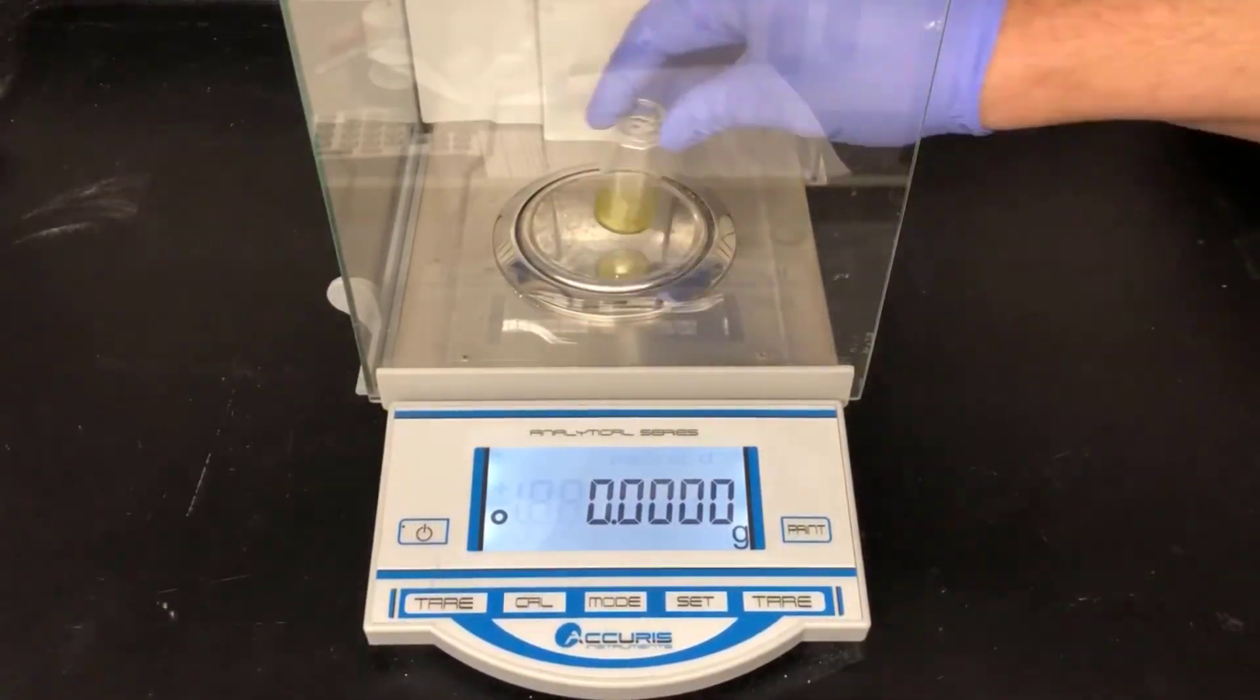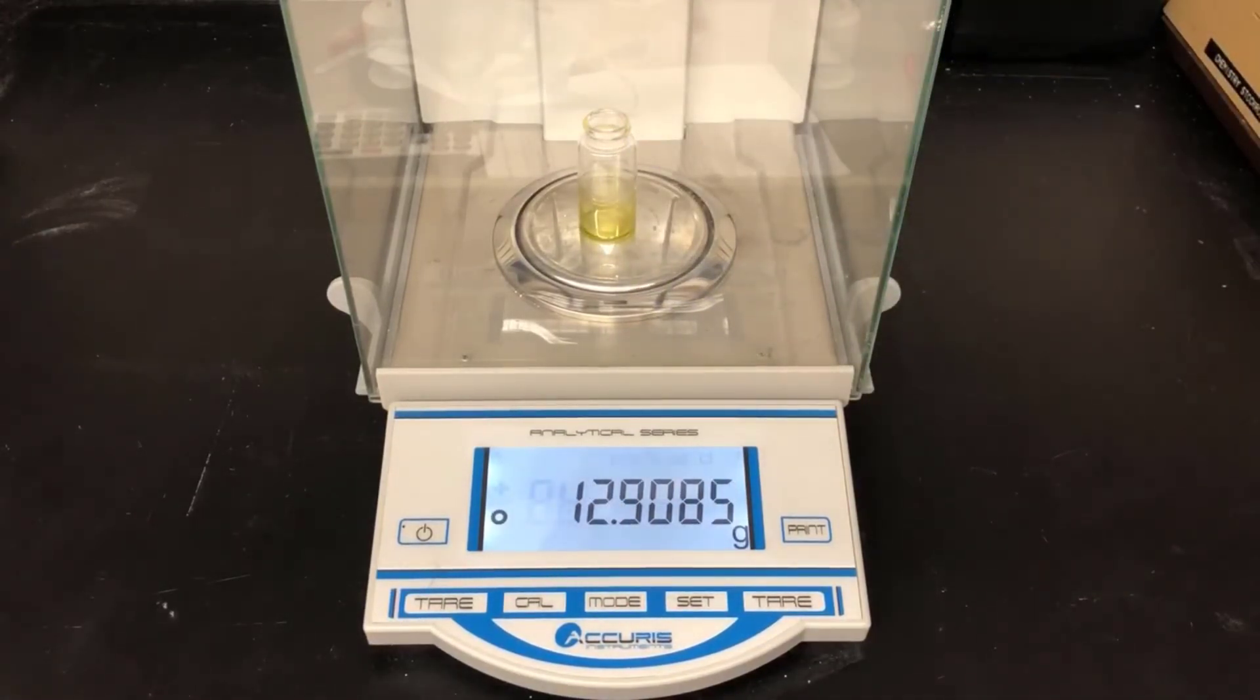Now I'll measure the mass of the vial and the citrus oil, and then subtract the mass of the empty vial that we determined earlier to get the mass of the citrus oil by difference.